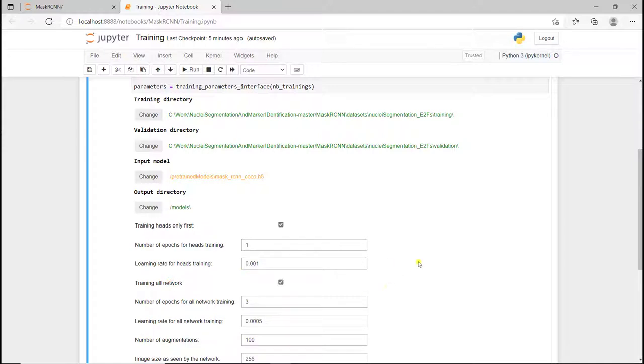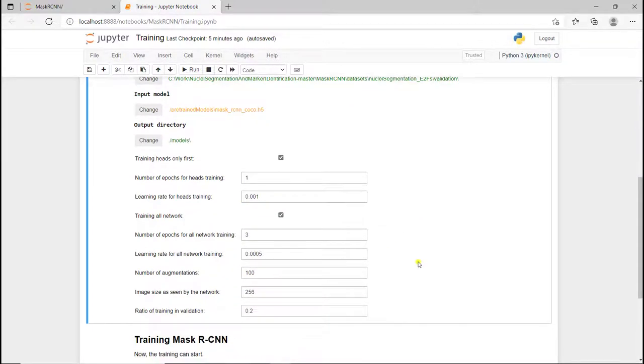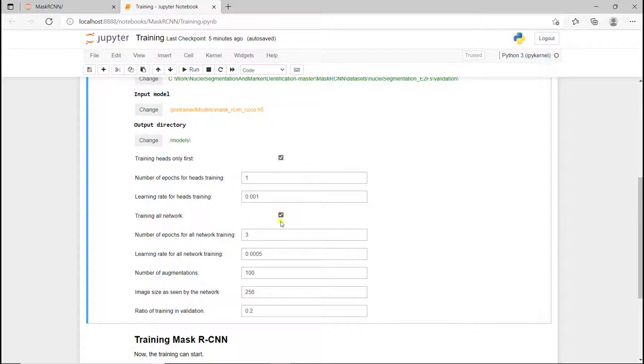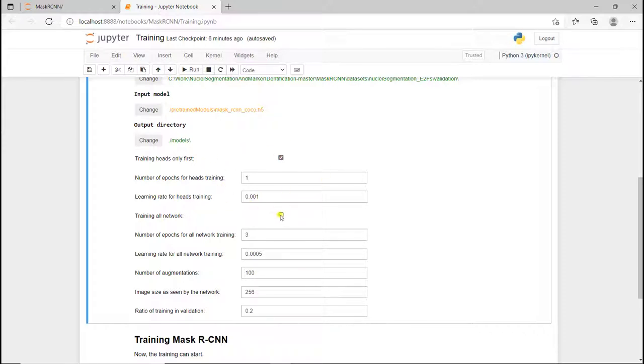Now we have the parameters related to the training. We can train heads only or train the whole network. If I uncheck this one, I'm just going to train the whole network. If I uncheck this and check this one, I'm just going to train the heads. Here I'm going to have both checked because I want to do fine-tuning, first training the heads only and then training the entire network.